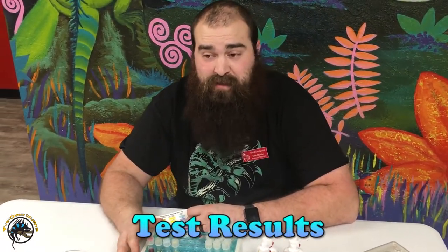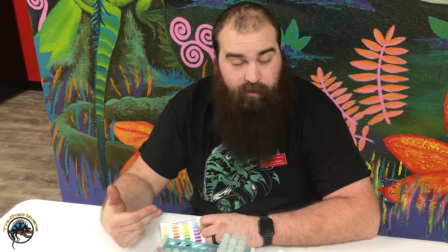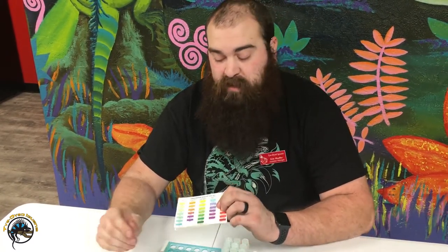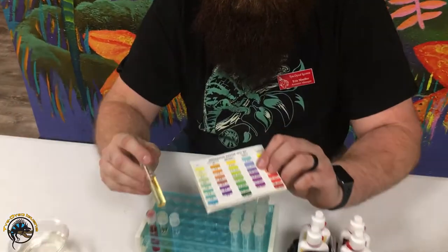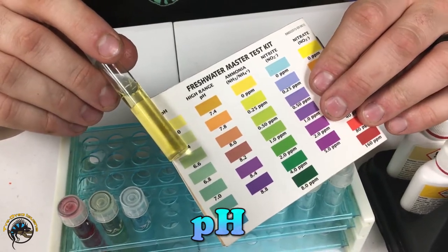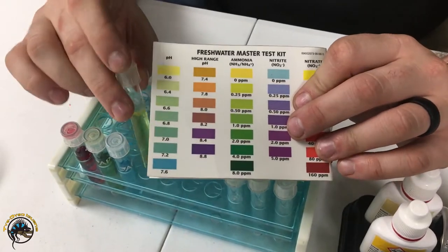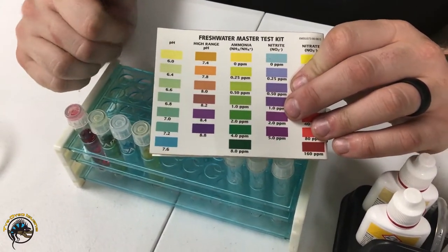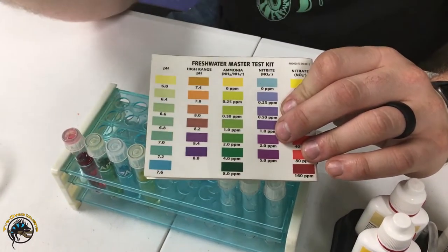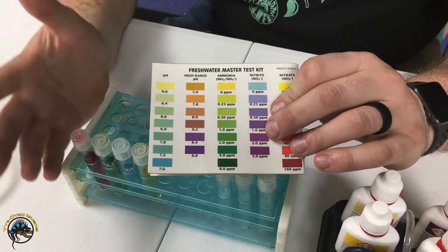All right, so now that our five minutes are up and the colors have developed, we'll go over the test results. First one, which is actually pretty crazy, is our pH — it's extremely low. Depending on your type of fish you may actually want it this low, but it's not very common. Most people keep their fish tank around a 7 pH, and if you're keeping African cichlids, you know, 7.8 to 8.2.